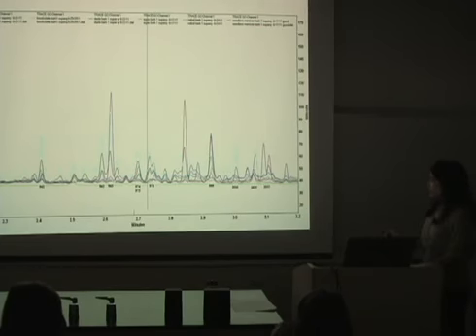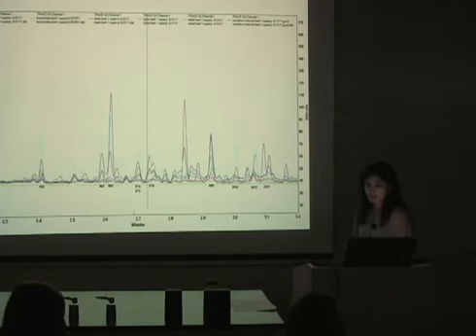So this is the same example, the gas chromatogram for the example that I showed in the data analysis, of the bark for all Super Q samples that I tested. So the patterns repeat, as you can see. So this may be showing more similarities than the data analysis that I showed there.